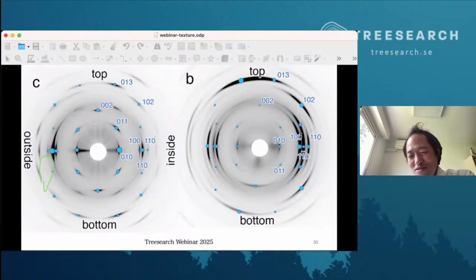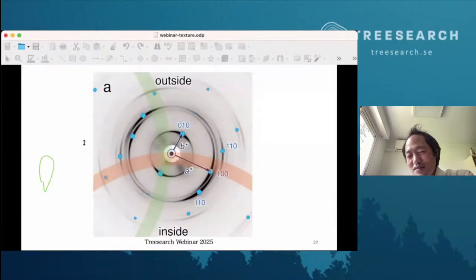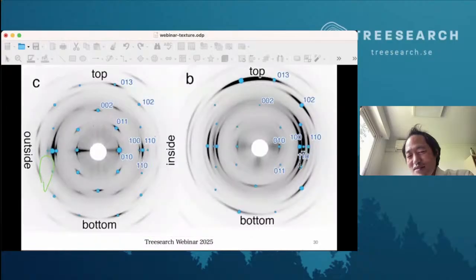On the right-hand side we have a strong reflection, and on the left-hand side we have the strong reflection, because we are cutting this part where you have a lot of reciprocal vectors pointing. We are cutting here, and we see this strong reflection. So if you imagine the system with a reciprocal vector concentration in reciprocal space, the interpretation of this kind of pattern becomes very straightforward.